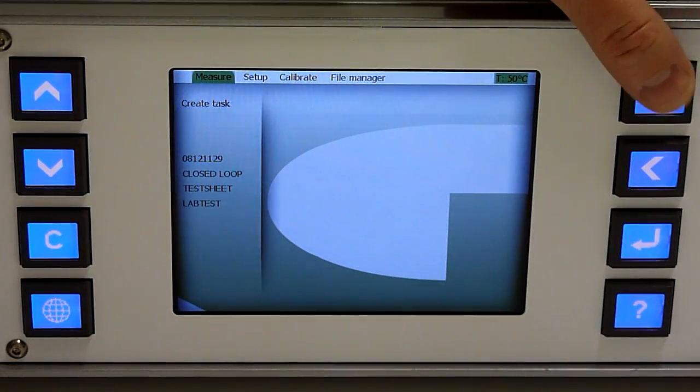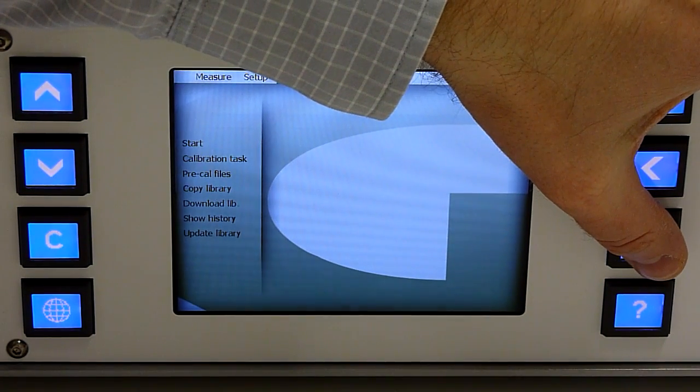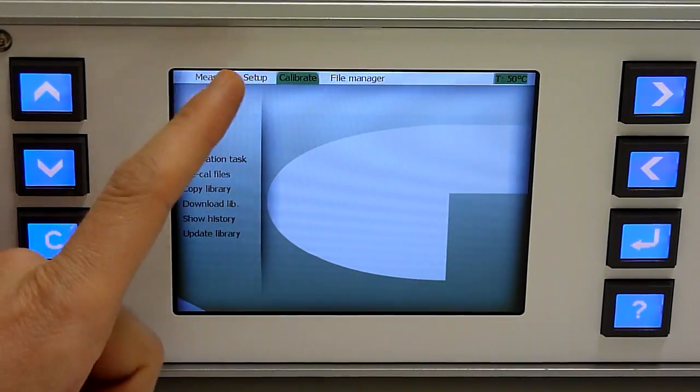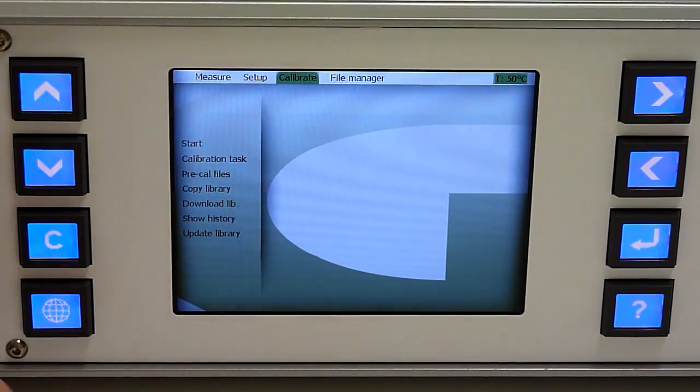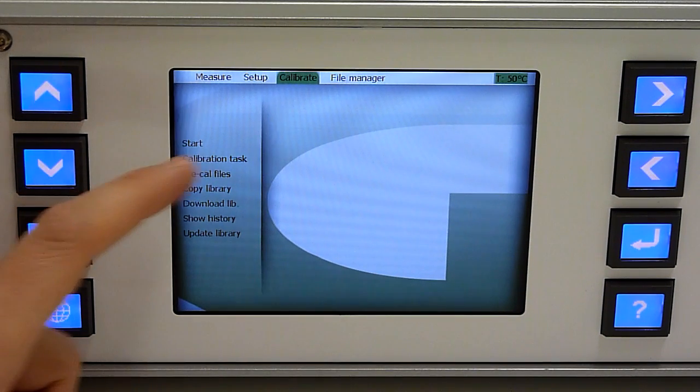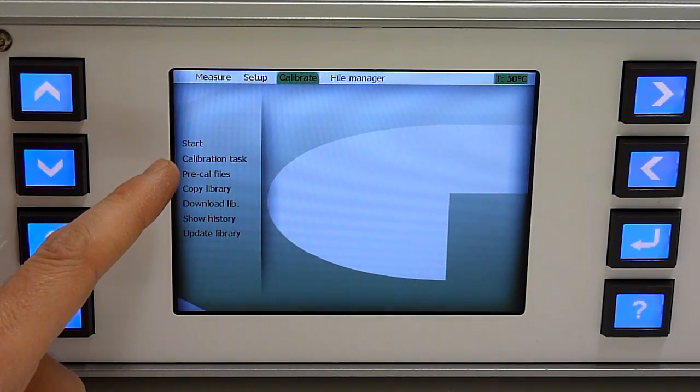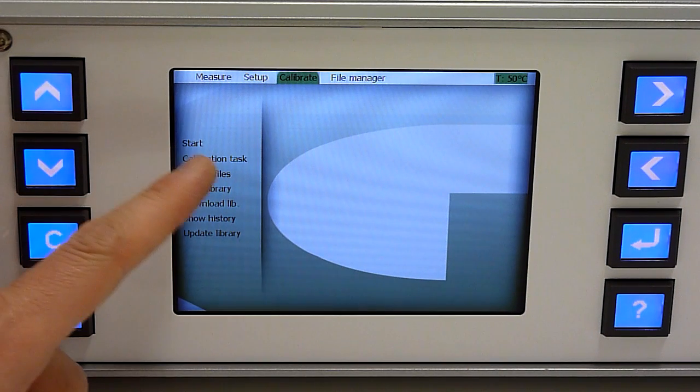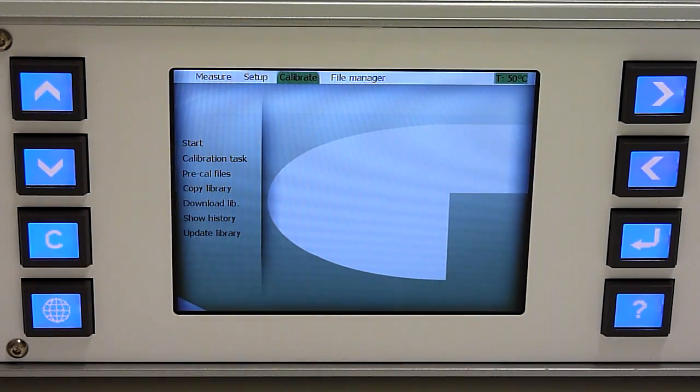Calibration of the instrument. When you go into the calibration menu, you have possibilities to calibrate the instrument and define parameters for the calibration task.